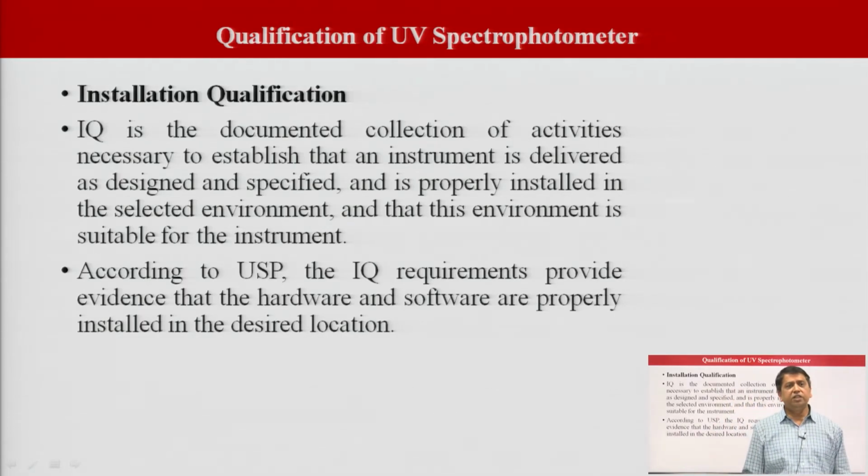Now, the next phase is the installation qualification. So, what is installation qualification? IQ is the documented collection of activities necessary to establish that an instrument is delivered as designed and specified and is properly installed in the selected environment, and that this environment is suitable for the instrument.